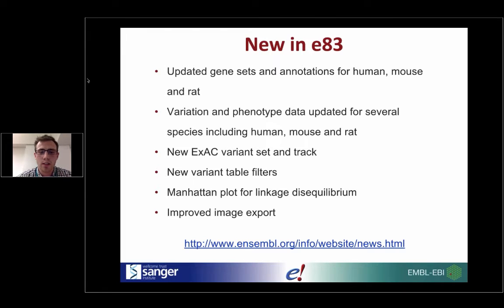This list is by no means exhaustive. There are many more updates; this is just the headlines. If you want to see all of the updates, then you can use the link at the bottom of this page, or you can click through to all of the updates via the Ensembl homepage.